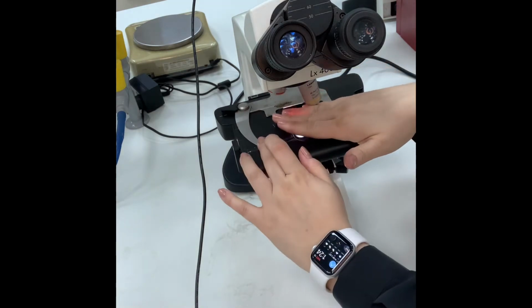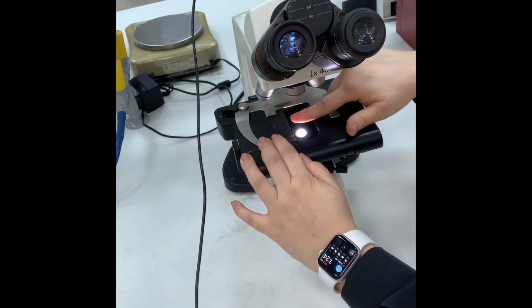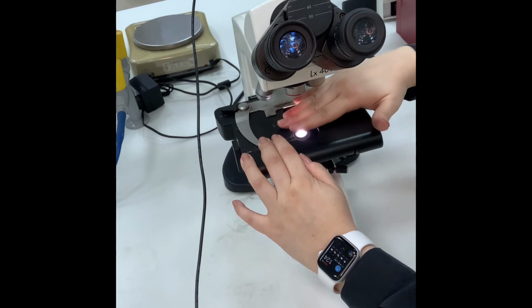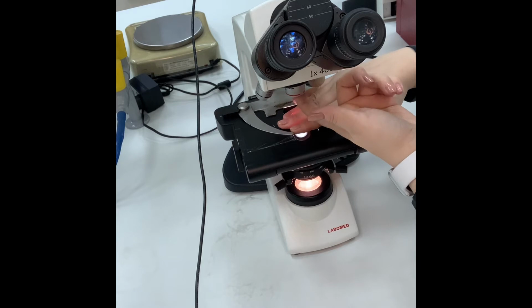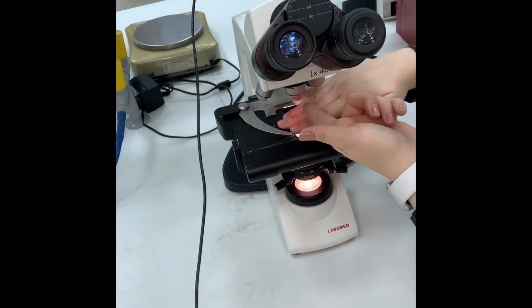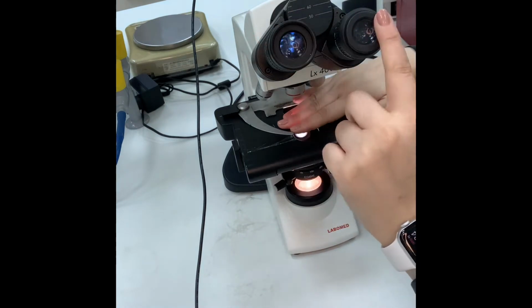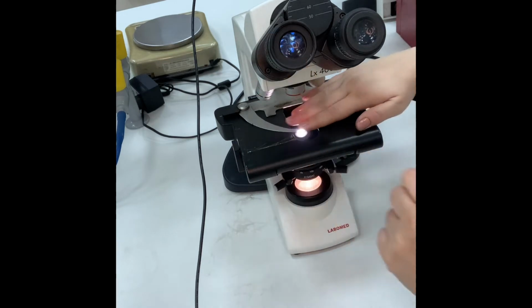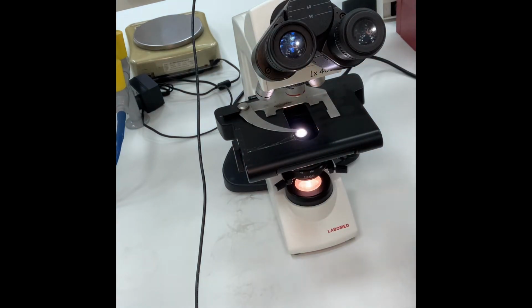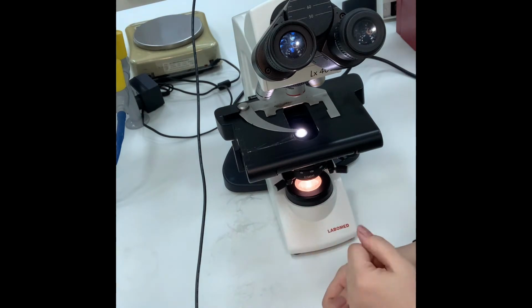This is where we apply the slide. Imagine this, my hand is the microscopic slide, and the lens over here will magnify the image in the slide, and through these lenses you can view the image. So basically, as I said, it's light and it's lenses, reflect and zooming lenses.